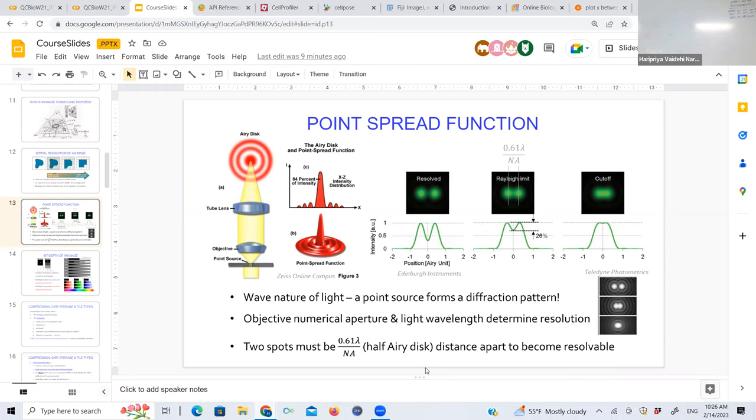And the reason for that is red is kinder on your cells or your tissues or whatever you're imaging. So I try to have things that are diffraction limited and resolvable in red because I really don't want to be shining blue light on my tissues. Biologically, it sucks because UV messes your skin, so clearly it messes your tissues and everything. Did that make sense?